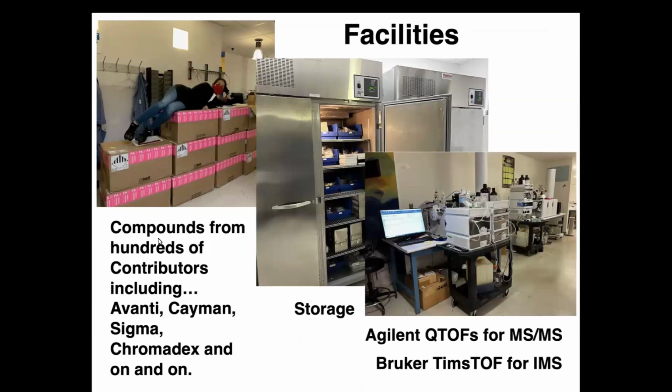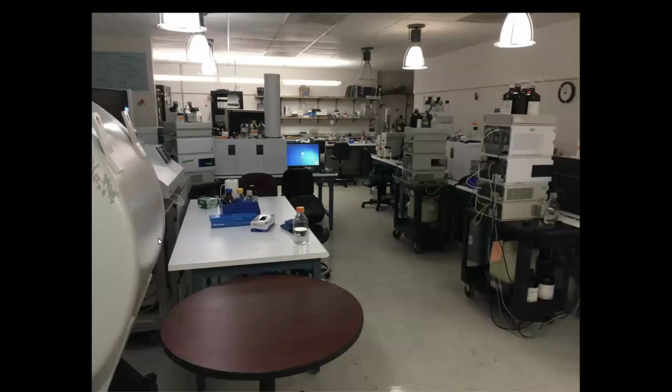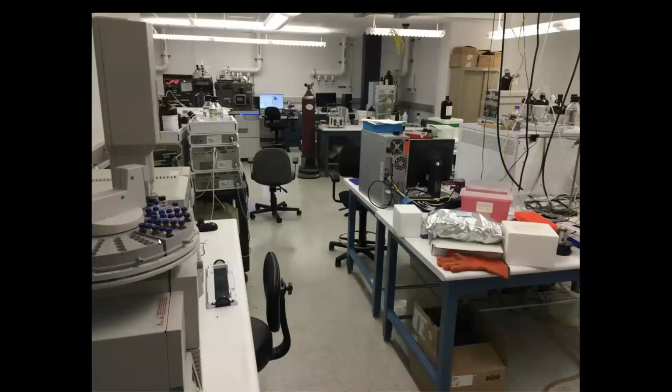For MS data, we use the Agilent QTOF to acquire the data. And for ion mobility MS, we use the Bruker timsTOF to acquire the data. And this was our lab on a daily basis. But sometimes things go wrong.